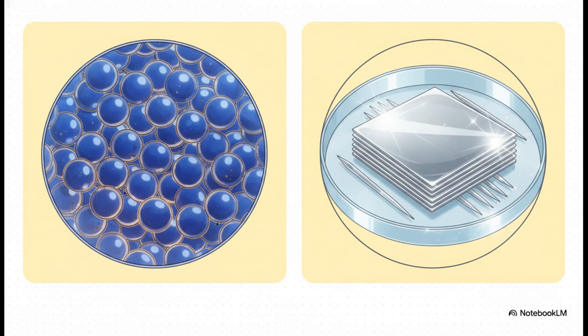If you rush your grinding, you might fall victim to a fatal flaw we call preferred orientation. Imagine your sample doesn't break down into those nice, random, isotropic spherical grains we want. Instead, say it forms flat, microscopic plates or long, elongated needles. Well, when you go to pack those into your flat sample holder, they aren't going to sit randomly. They're naturally going to stack flat on top of each other, aligning with all their neighbors. This artificially blows up the diffraction signal from the flat planes and completely hides the planes standing on edge. It totally ruins your statistical data, so always grind your samples properly.